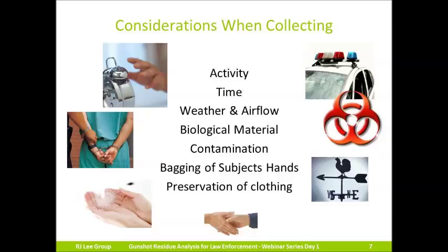So the first factor is movement, motion, or activity. These are big factors which could potentially cause particulate loss. And the more time that passes, the more potential there is for particles to be lost. Washing hands, wiping hands on clothing, putting hands in and out of pockets, running, shaking hands with other people. These are all activities that could cause particles to be removed. This is also why clothing may be a better option for you to consider sampling if a long amount of time has passed since the incident.